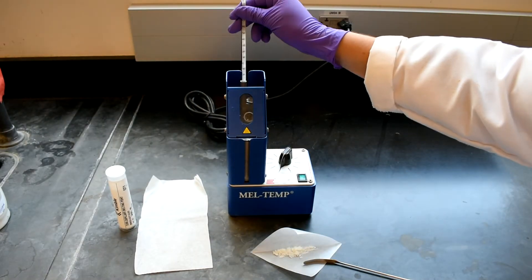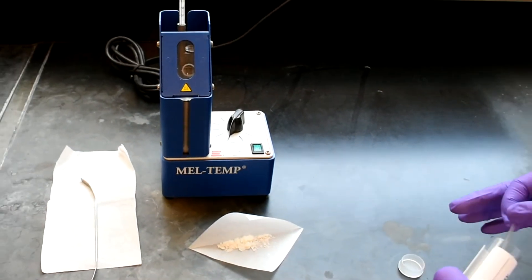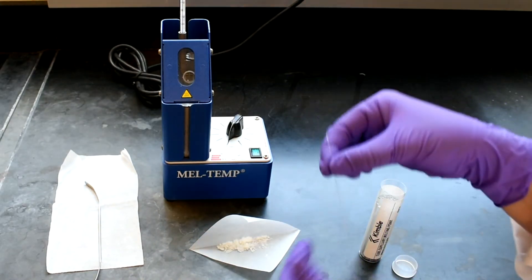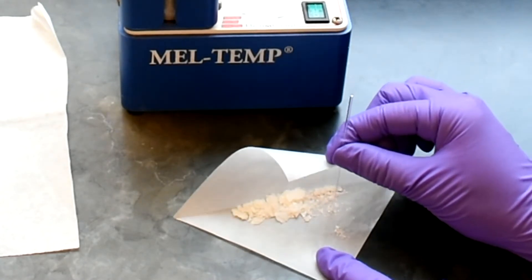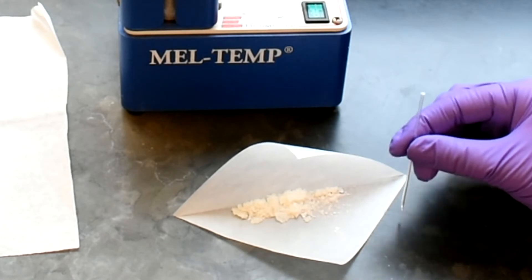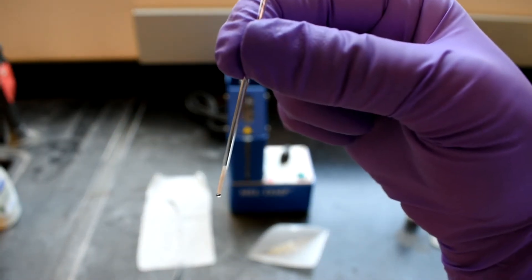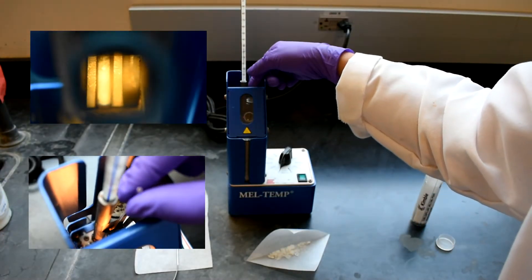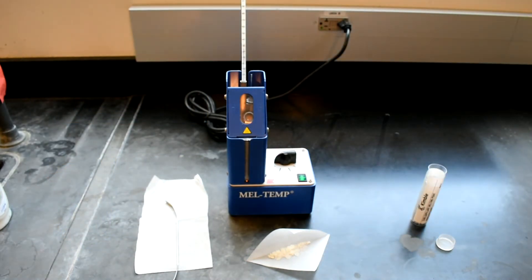Add the thermometer to the Meltemp. Then carefully crush some of your sample into a finer powder so that it will fit in a capillary tube. Press the open end of the capillary tube into the sample, then flip the tube over and tap the closed end on the lab bench so that your sample settles on the bottom. Repeat until there is about a centimeter of your sample in the capillary tube. Add the capillary to the sample chamber of the Meltemp apparatus and turn it on. Set the power to a level that causes the temperature to increase at a rate of about 5 to 10 degrees Celsius per minute.